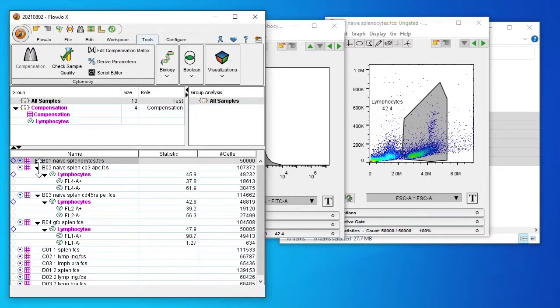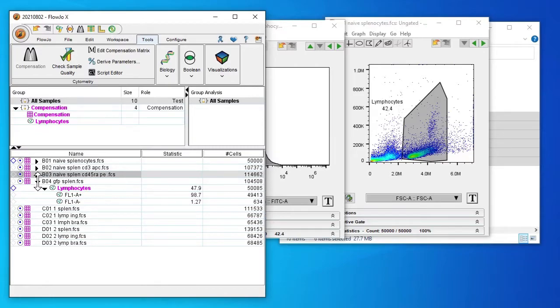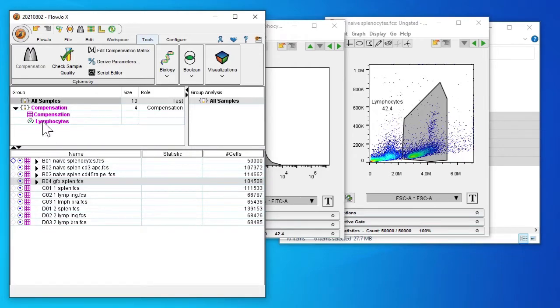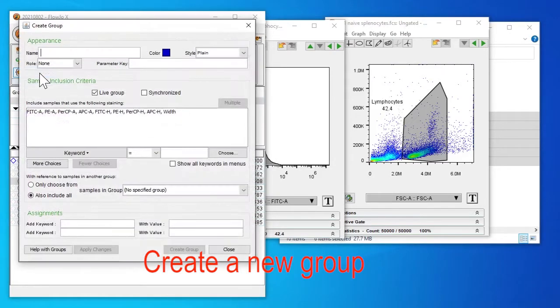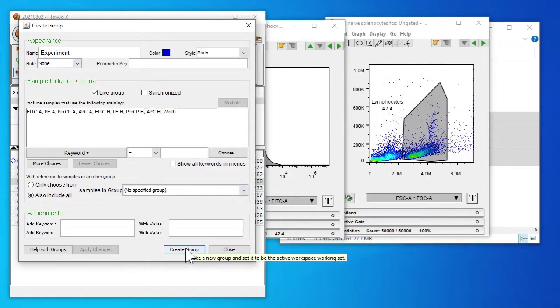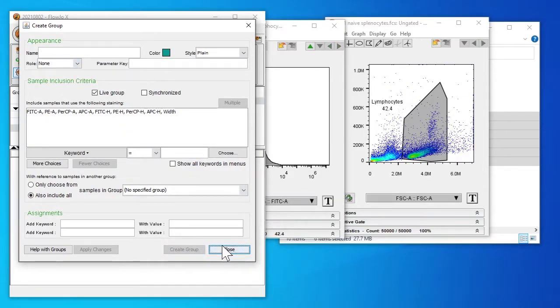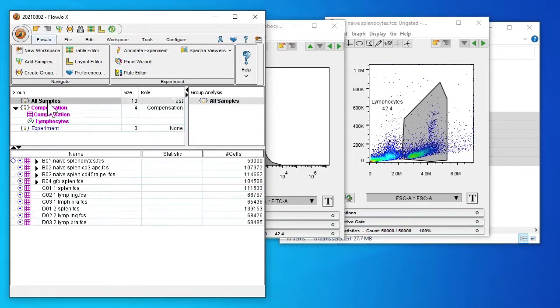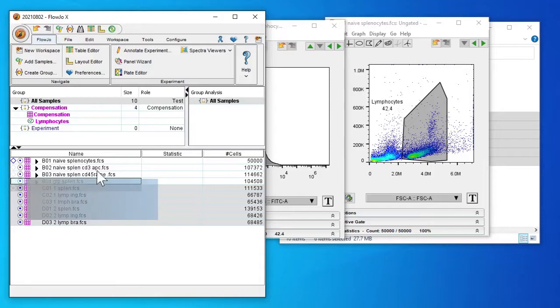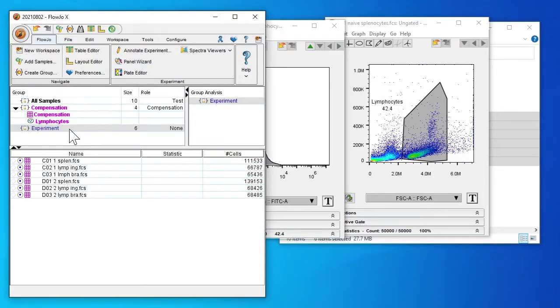Just going to minimize all our compensation samples. So we want to use and look at our experimental samples. So we'll create a new group, we'll name it experiment. From our all samples select our samples of interest and drag to experiment.